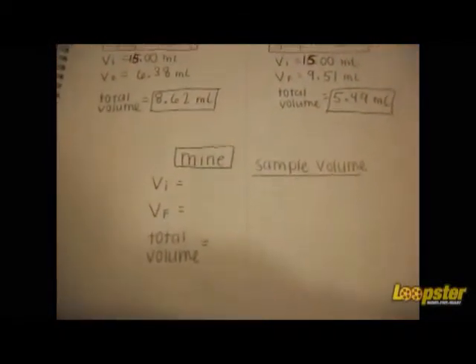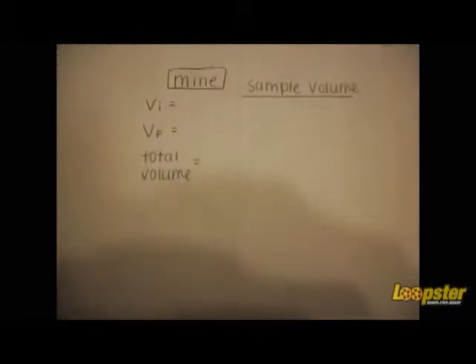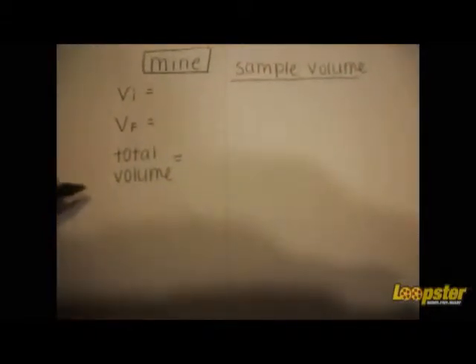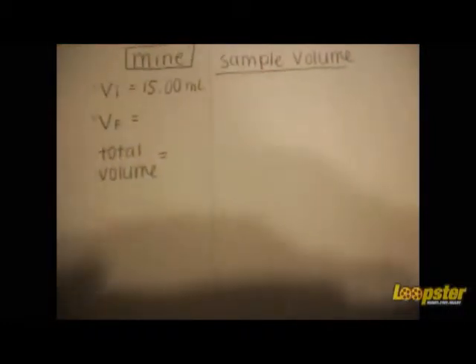Above are my past group members who are not present with me right now, so I will record my volume alone. My initial volume, as we just demonstrated, was 15.00 milliliters.